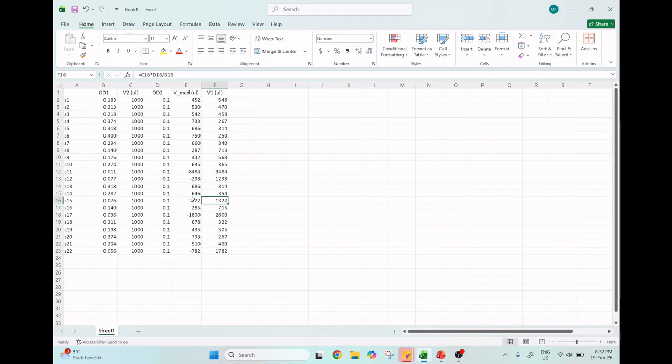So in this case, we would have to let the culture grow more, or discard them because they didn't grow well. But in general, for all of those where it works, you then take this amount of solvent or of medium, put it in your tubes, and then you take this amount of your culture and add it to this medium.